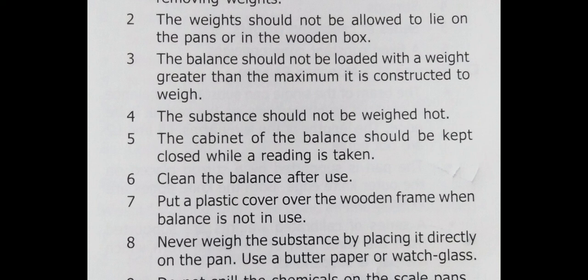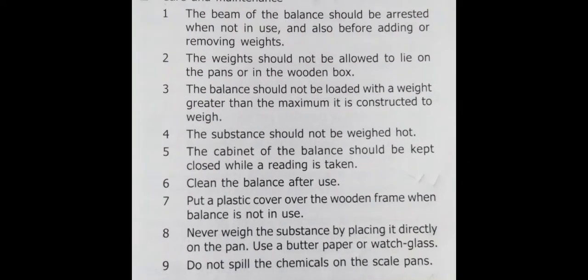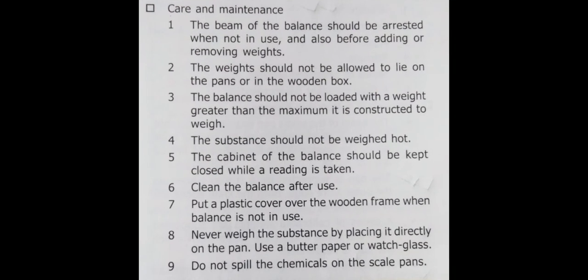Then clean the balance after use. Put a plastic cover over the wooden frame when the balance is not in use. Never weigh the substance by placing it directly on the pan. Use butter paper or a watch glass. Do not spill the chemicals on the scale pans.